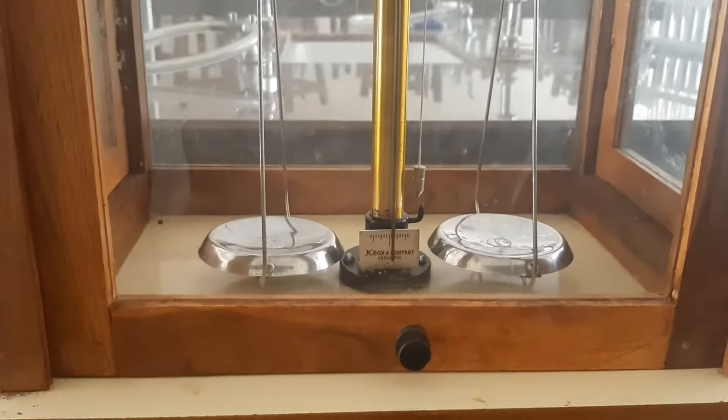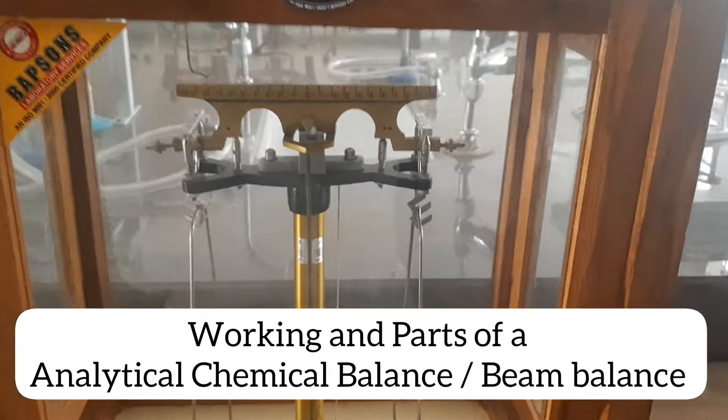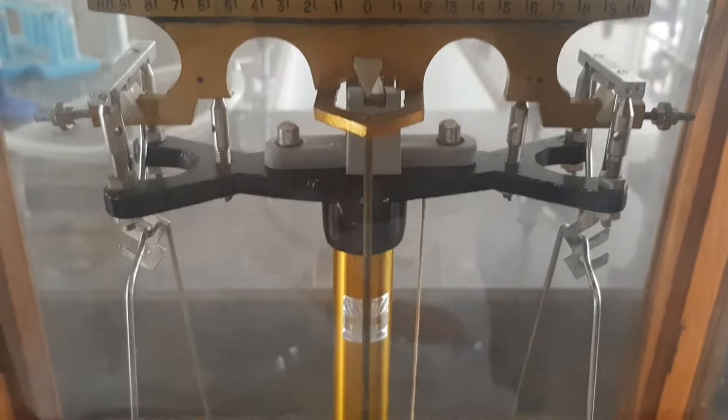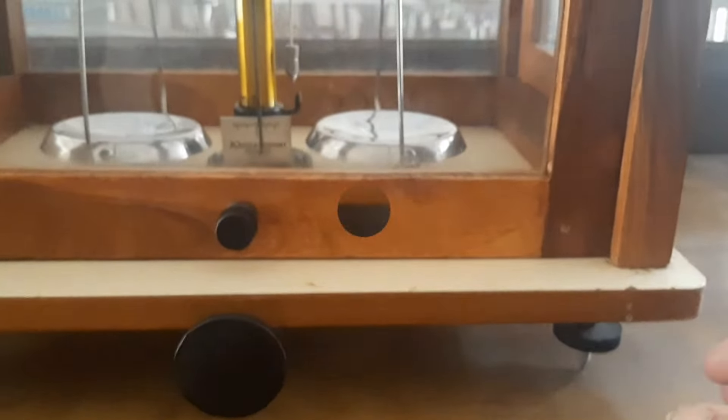Today I am going to discuss the analytical balance, the beam balance, or the weighing balance. See carefully the various components of this analytical balance — this is how it looks.